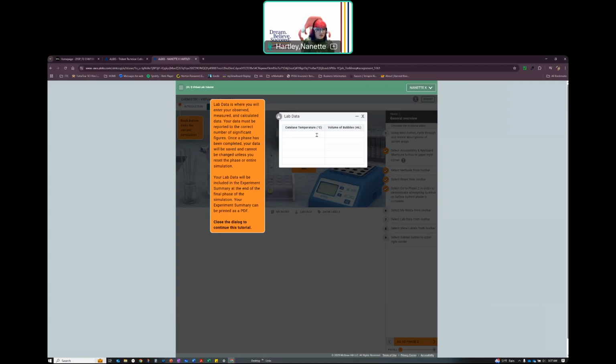It's normally somebody else. Okay? So we need to make sure that that data is legible and understandable by someone else. And that's why somebody else has to review it. So these are all things that are part of keeping a lab notebook and keeping that information. That lab notebook is designed so that someone else can repeat what you've done in the laboratory.